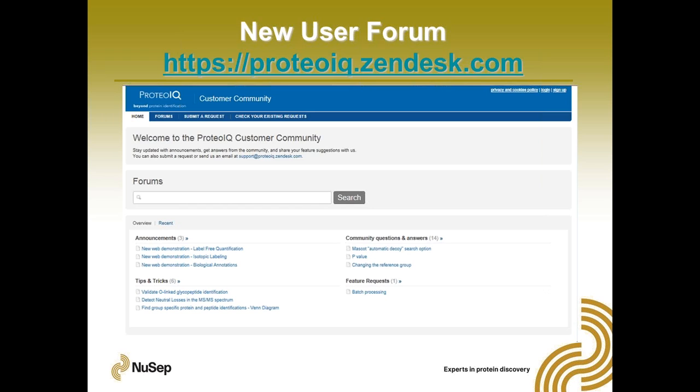Essentially, everyone's going to get an email for this. You should have had it in your webinar invite, and we'll do another release of this as well next week, another email to you. This is a place for you to exchange ideas. So we've already pre-populated this with a number of frequently asked questions, common questions and answers. And just like any forum, this allows you to go in and ask a question. Other users of ProteoIQ can comment. We can comment, basically build a knowledge base of the software there. We've had a couple requests for new features.